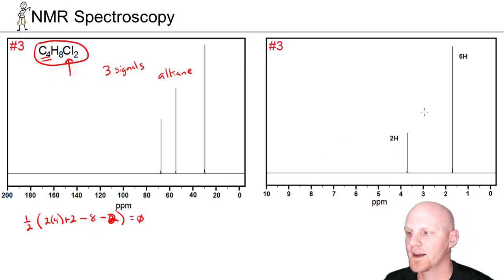If we look at the proton NMR, it looks a lot like the carbon NMR. Aren't these supposed to have area under the peak and multiplicity? Well, these are both singlets. So in this case, there's no mistake here. This is indeed a proton NMR.